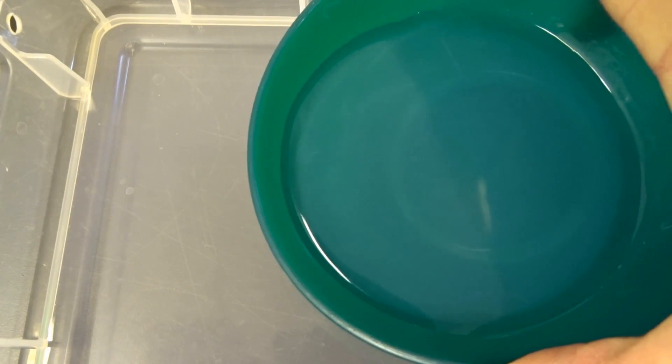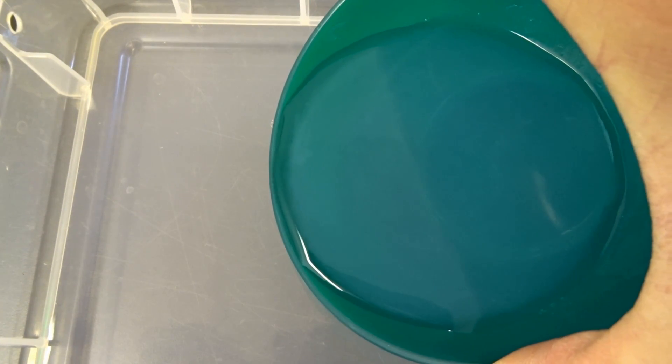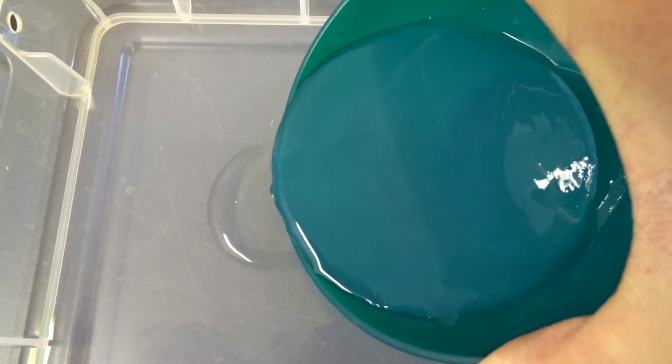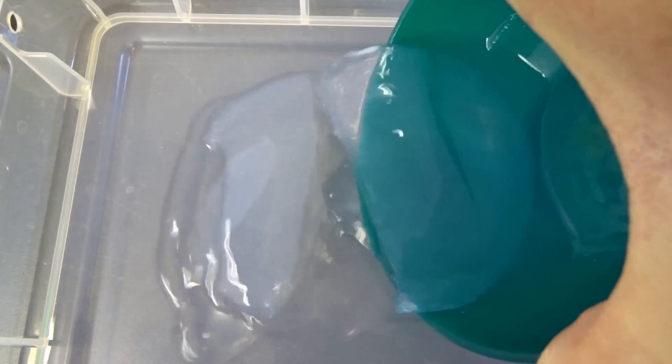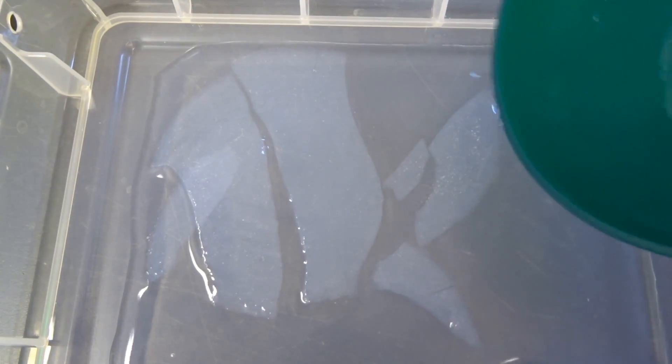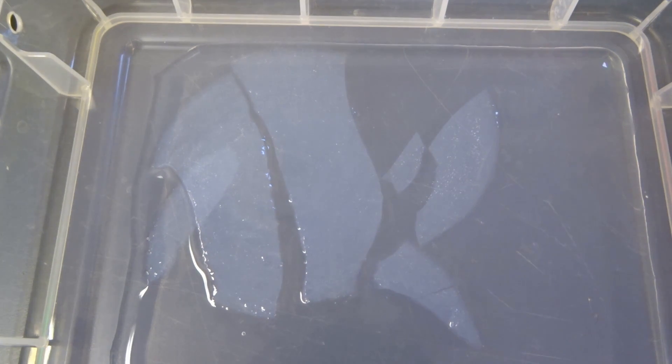Here you see the gel that formed in the green dish, and I'm now pouring it off into this plastic container, and you see there's first some water covering the top, and then there's the gel underneath, which unfortunately broke apart as I pour them out, since they are really, really fragile.